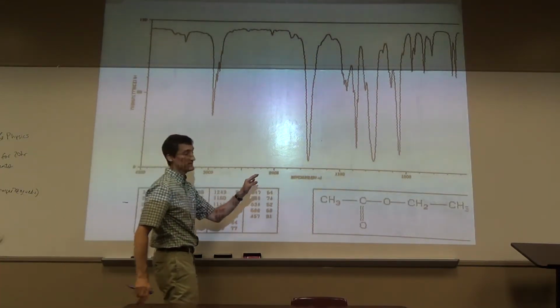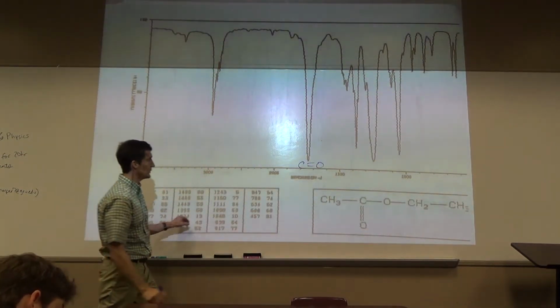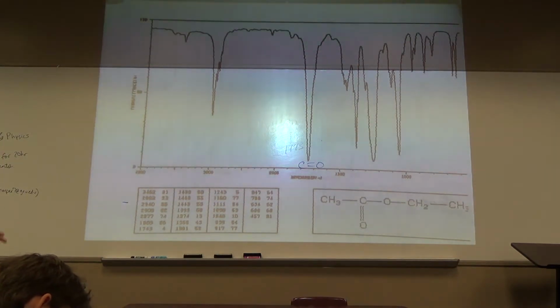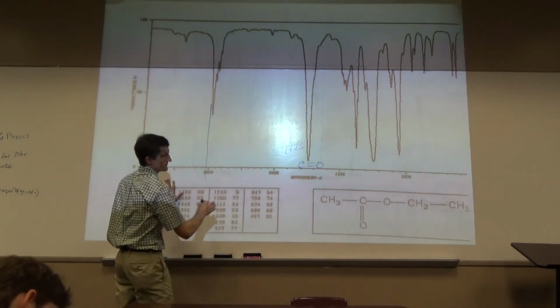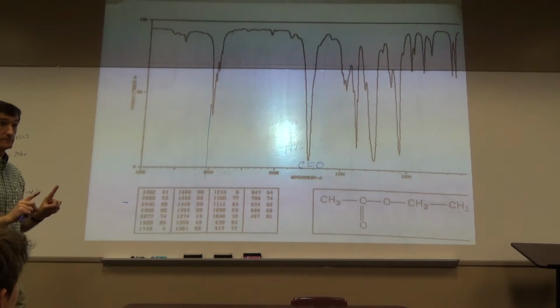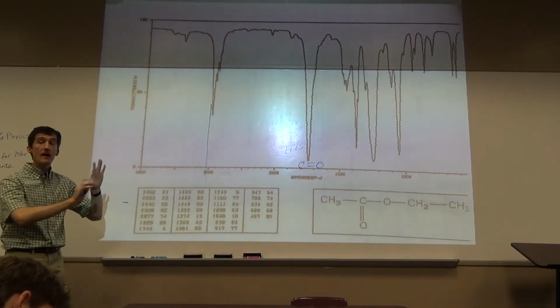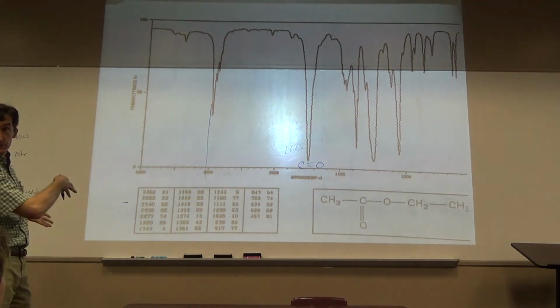Got a carbonyl here, right? Where's this big guy? Actual is 1743. It's actually a little higher than the others, yeah? Esters tend to be a touch higher. Can't put much into that, but okay. What we got here? Everything else is saturated, right? When I say saturated, I'm saying sp3ch. Okay? The rest is saturated. Probably an overtone. Carbonyls often give overtone, especially in textbooks. Not so much these days because things down here tend to be weaker and you don't see overtones as much.